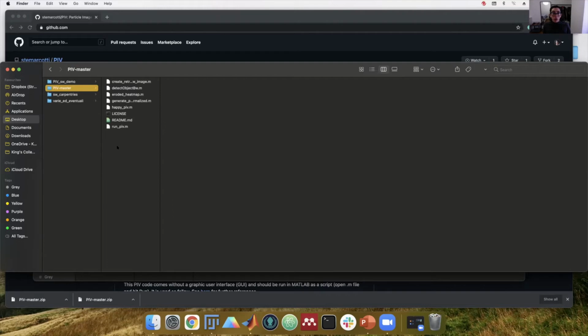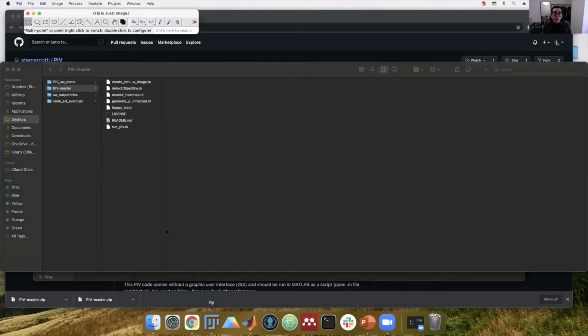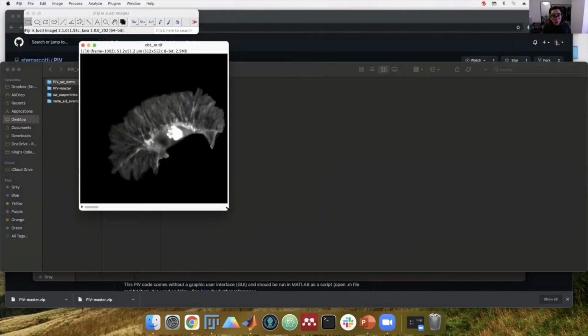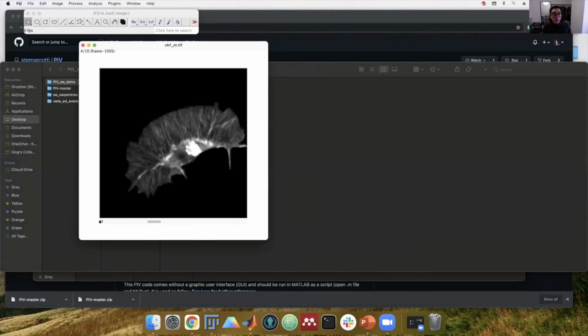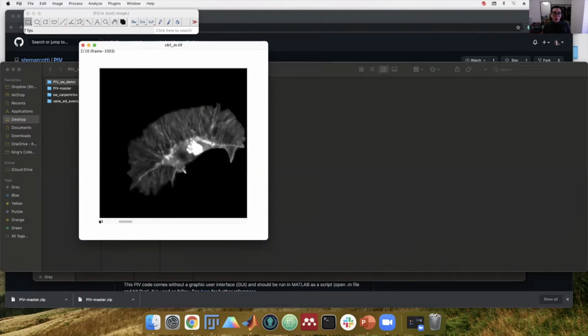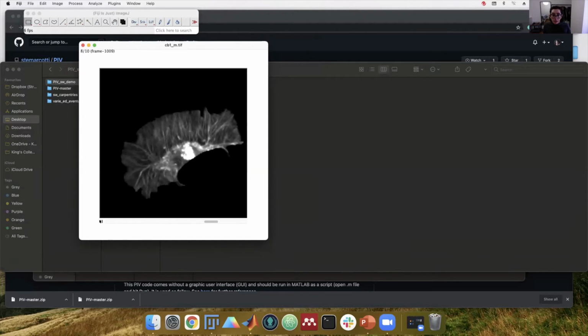some of which I'm going to show you how they work in a second. We also need a movie or an input for our tracking. And I'm going to use as a movie one of the cells that I showed you before. So here you can see the cell, and it is a short movie. I just cut it to 10 frames roughly in the interest of time. So again, this is a cell with actin being highlighted, moving in vivo in a Drosophila embryo.